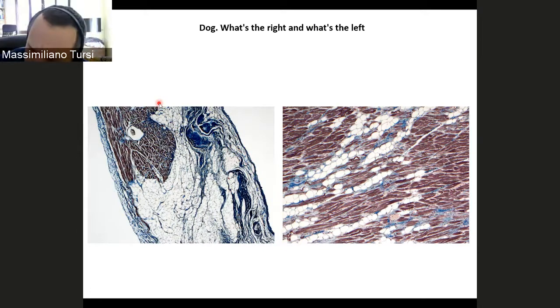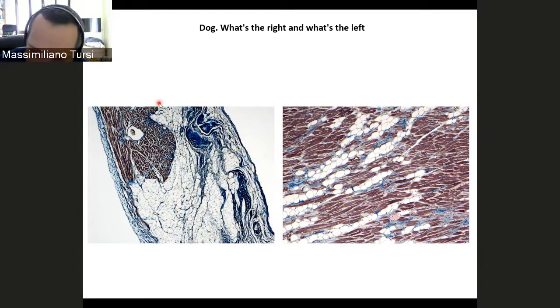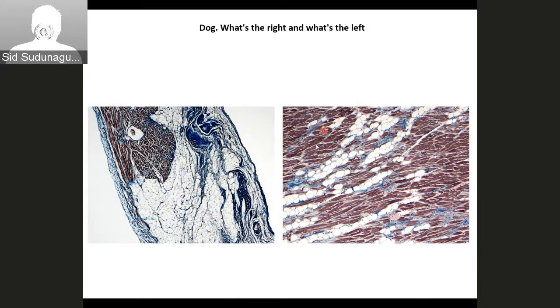Do you remember? I'm not sure. It could be a kind of cardiomyopathy. The only one I could guess would be dilated cardiomyopathy. That's correct. That's a fibrofatty type of dilated cardiomyopathy in dog. Okay, thank you. And that's the correct presentation.